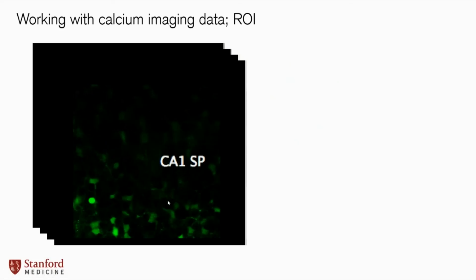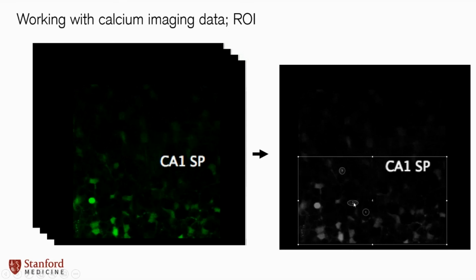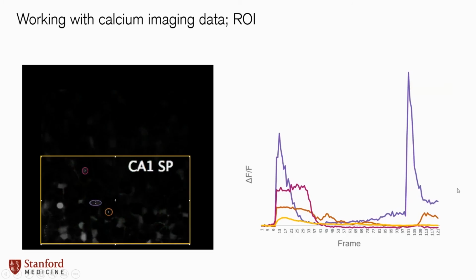Just to give you guys an idea of how to work with it, you'll basically look at a stack of individual images, and then within those images, you can draw these little regions of interest. To show you guys how easy it is, I actually downloaded Jamie's video from his paper and loaded it up into ImageJ. It's free image analysis software. And I drew my own little ROIs and quantified that fluorescence change over time. And here you can see on the right, you can almost tell exactly when the ultrasound went on. So it went on right here. You can see that the cells all rapidly respond, and the cells are circled over here. So it's really that easy if you have a picture of the brain.